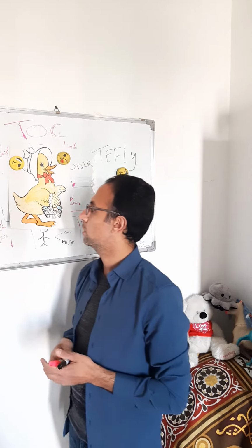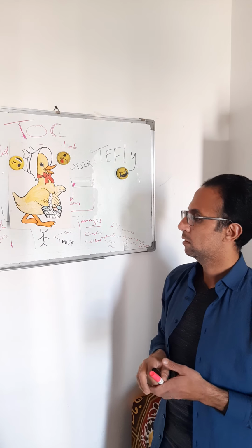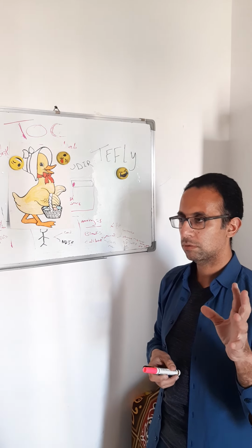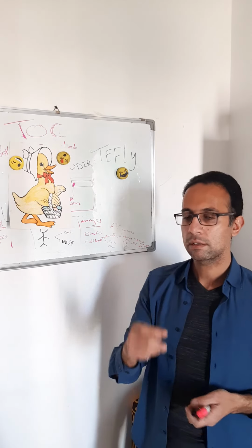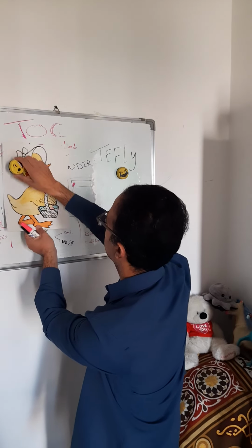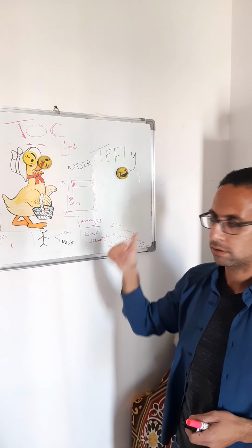CO2 is measured actually like, can you guess? Type of spectrum also? Maybe, yeah. Okay, this spectrum, which is called NDIR, non-dispersive infrared detector. Actually, that's right.